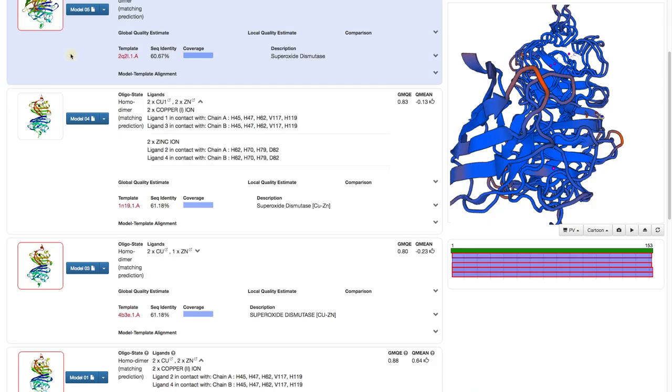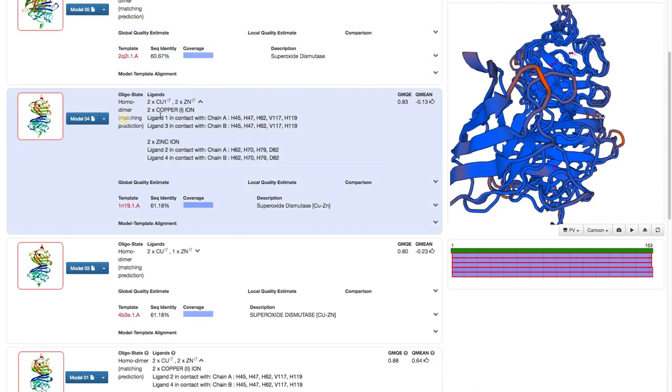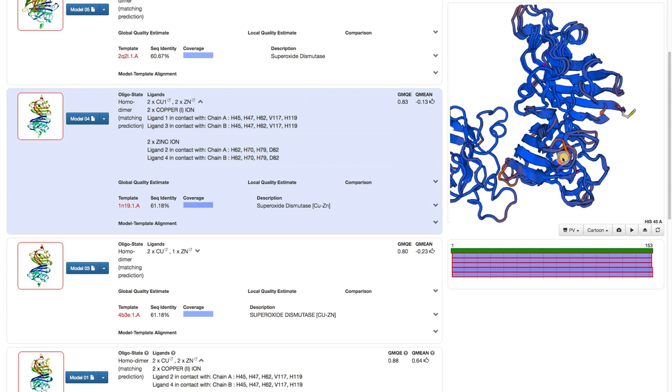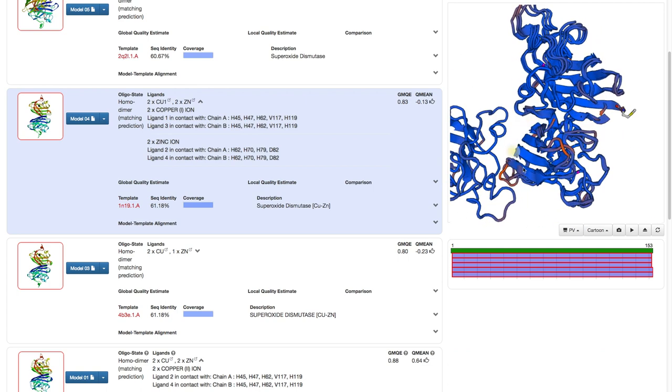If we select the model from the other cluster, we can also immediately see what this other cluster was. This chain aligns perfectly with the other models, but the interface between the two chains is a completely different one.